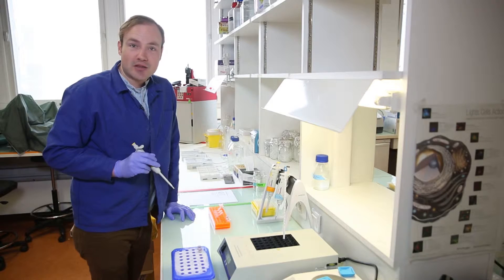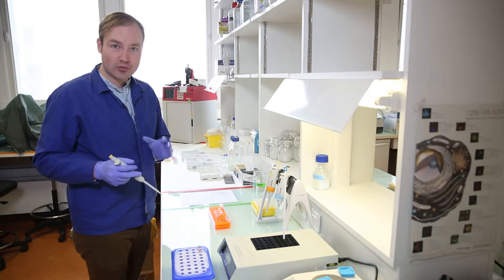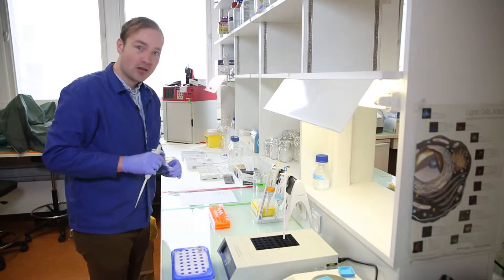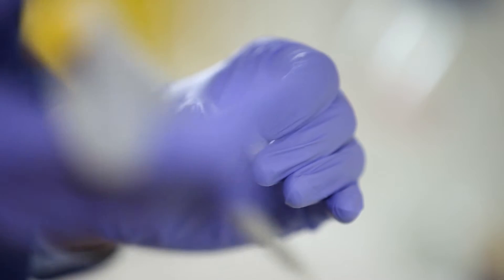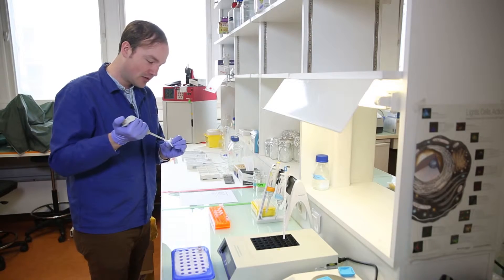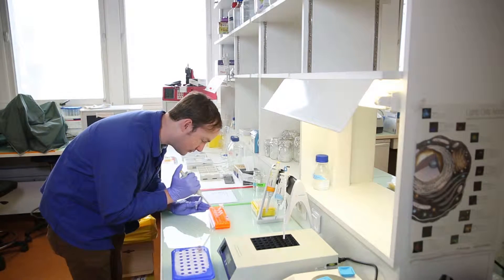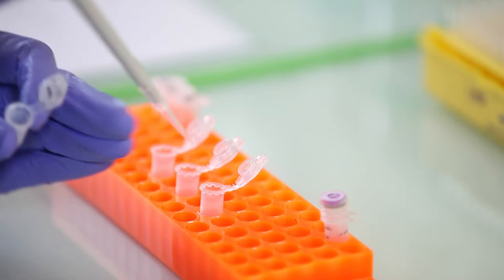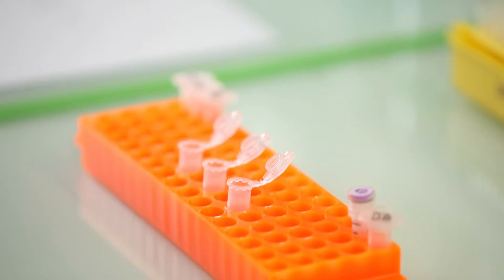Next, the plasmid. For this reaction, we'll be using PSB1C3, which is a standard biobrick plasmid. You can get the sequence from the biobrick registry, or we'll make it available on the site. The plasmid I'm using today has a concentration of 160 nanograms per microliter. I'll be adding 10 microliters of plasmid, and that gives me about one and a half micrograms of plasmid total.